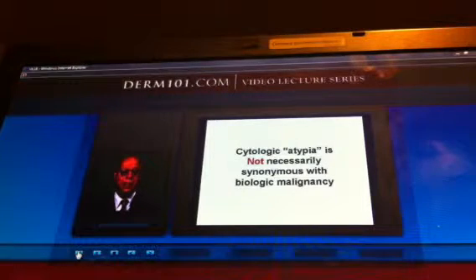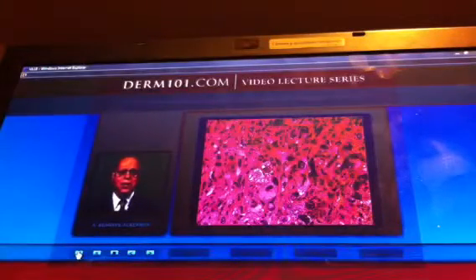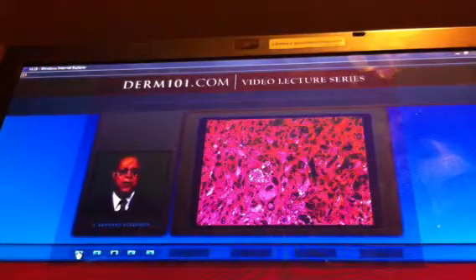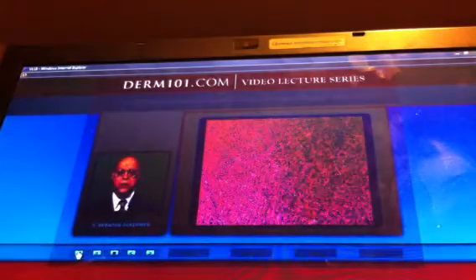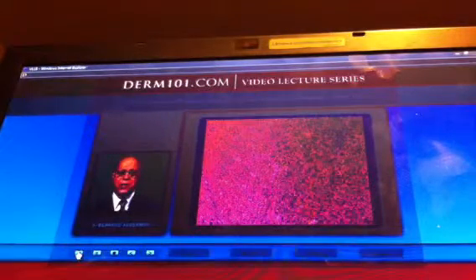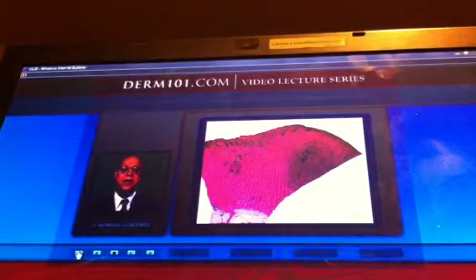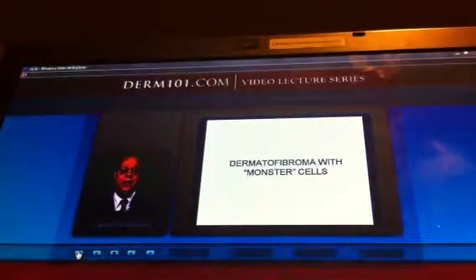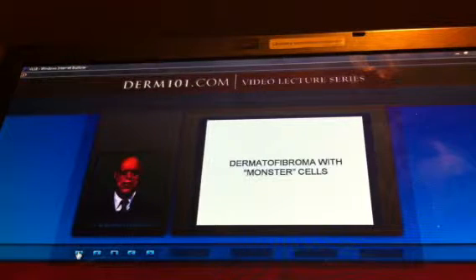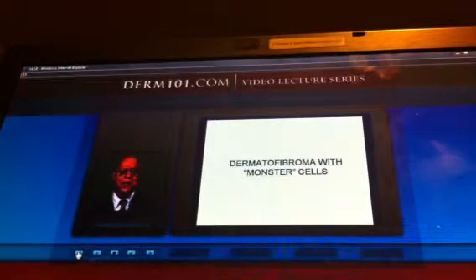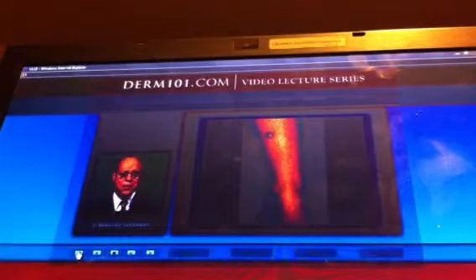Cytologic atypia is not necessarily synonymous with biologic malignancy. Look at how atypical these histiocytes are — many of them foaming. At lower magnification, in addition to lipophages, there are siderophages. This is a dermatofibroma with so-called monster cells, that is how atypical the nuclei are. But this process is not even neoplastic — it is a fibrosing inflammatory process.